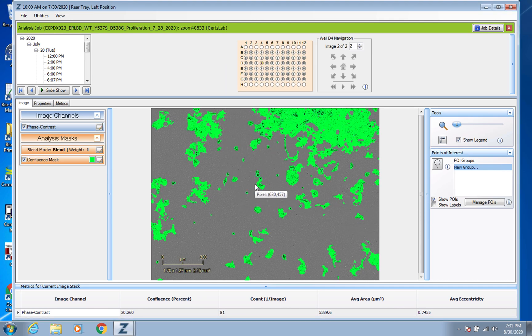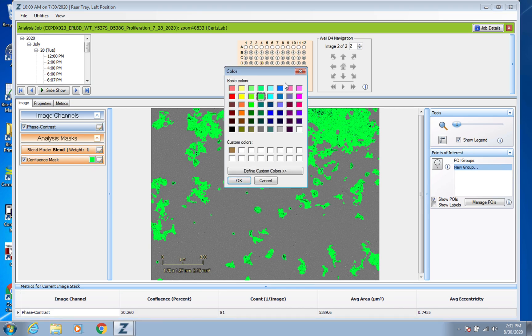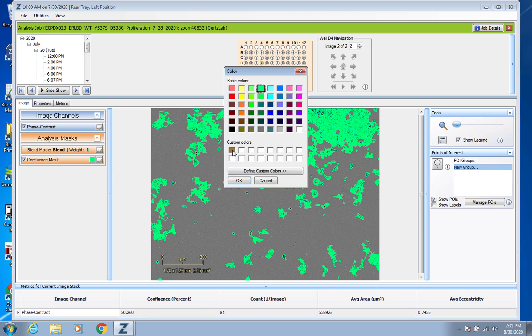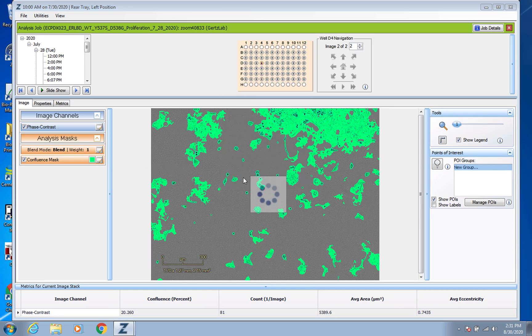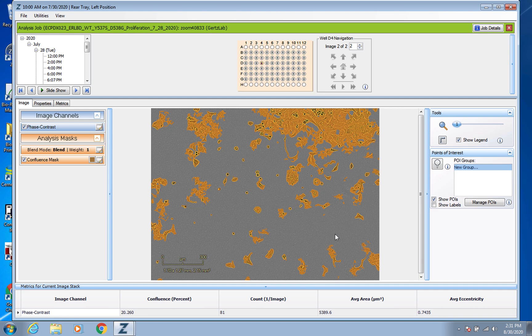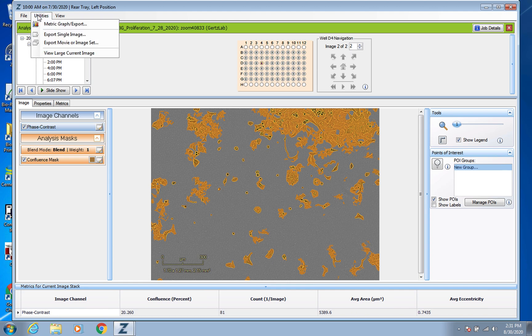So I love lime green for everything. Say you did though want an individual picture of a specific well, you could go up here to I think it's Utilities, yeah Export Single Image, and just follow along through that process.